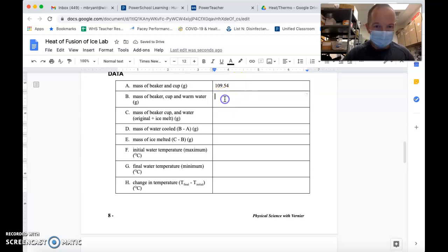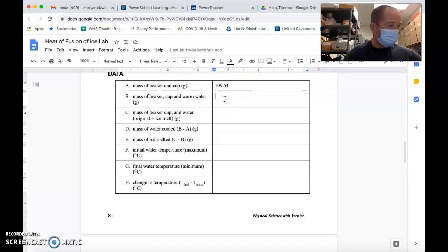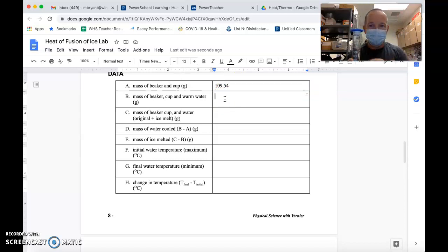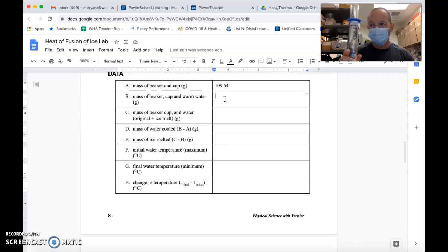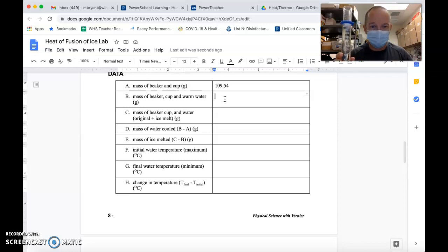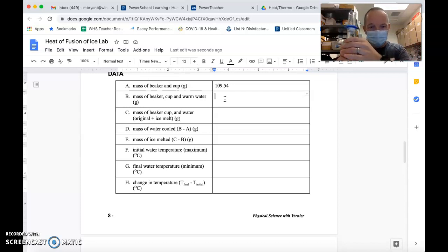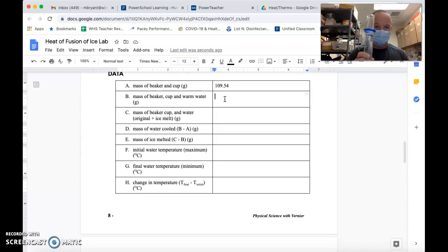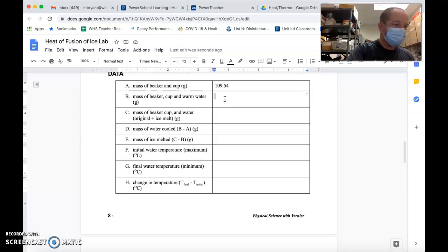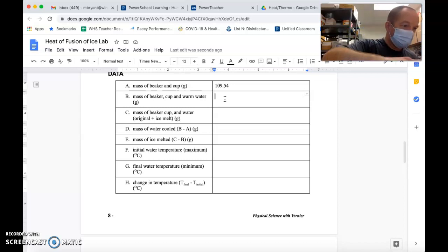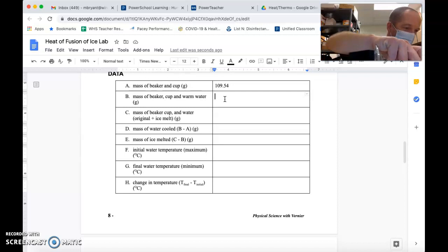Now, I have this graduated cylinder full of about 100 milliliters of warm water. Basically I just ran the hot water under the tap and put this in. I'm going to go ahead and add this to the beaker, to my styrofoam cup and the beaker.